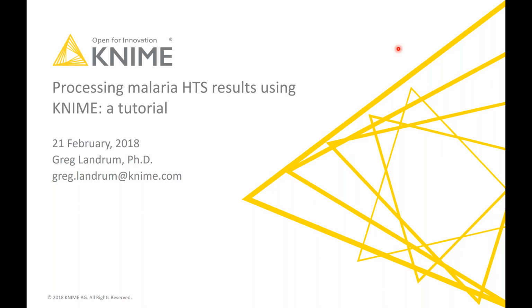Thanks, and thanks for the chance to do this presentation. I am audible, right? Yeah, I can hear you. Okay, cool. So as Carolyn said, I'm going to walk through a tutorial showing a bit of how you can do processing of high throughput screening results with Knime.